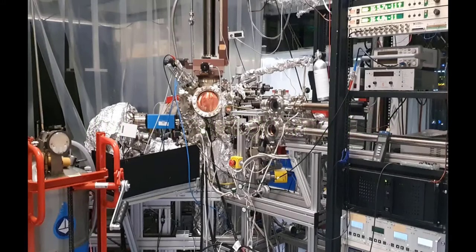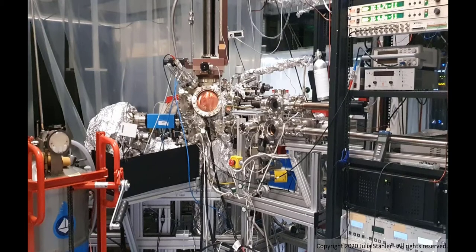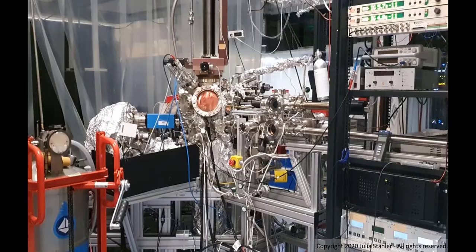Today I will tell you why we use ultra-high vacuum technology in some of our experiments. This is a good question because why would anyone invest so much effort into such a machine if not necessary?